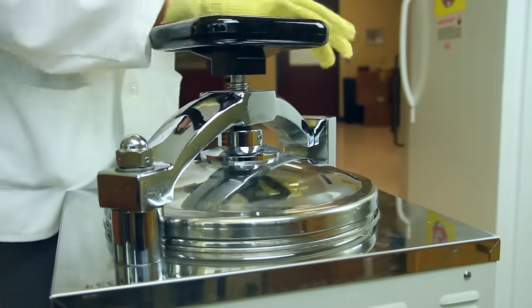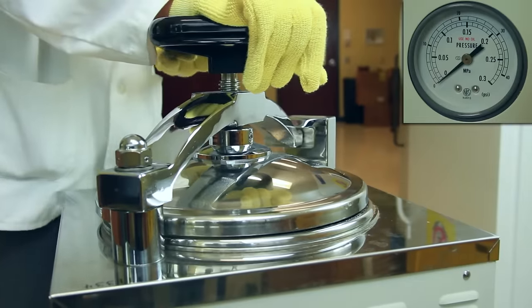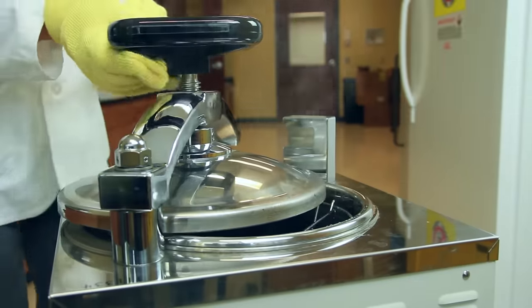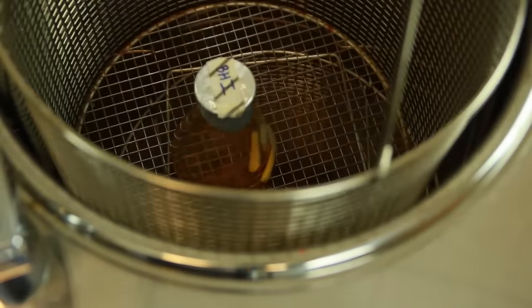Once the cycle ends and the pressure gauge reads 0 PSI, use heat-resistant gloves to slowly open the lid and remove the sterilized flask.